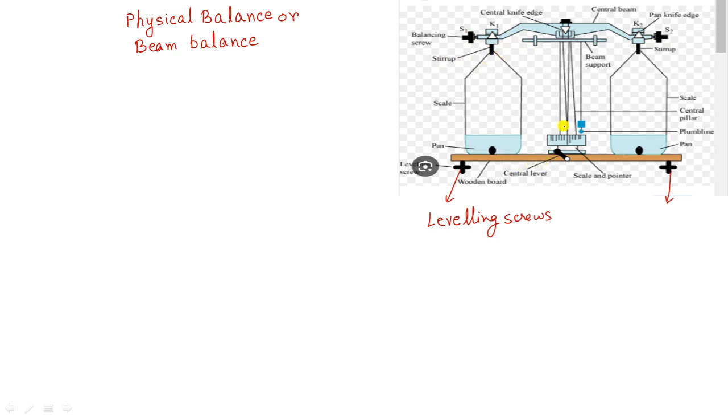Here you see the scale and the pointer. This is the plumb line. The main function of the plumb line is to check whether the beam balance is in a horizontal position. You adjust the leveling screws to make the plumb line straight. When the plumb line is in a straight line, the physical balance is ready to measure the mass of an object.